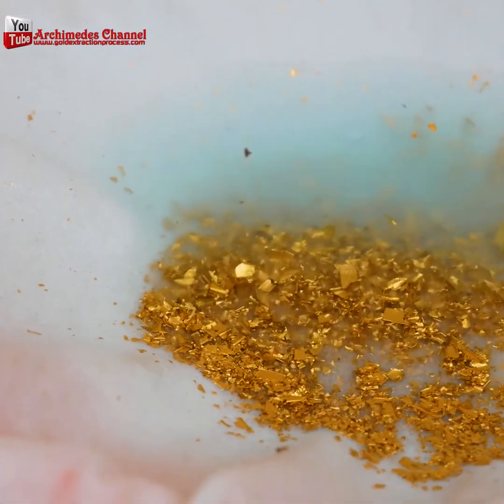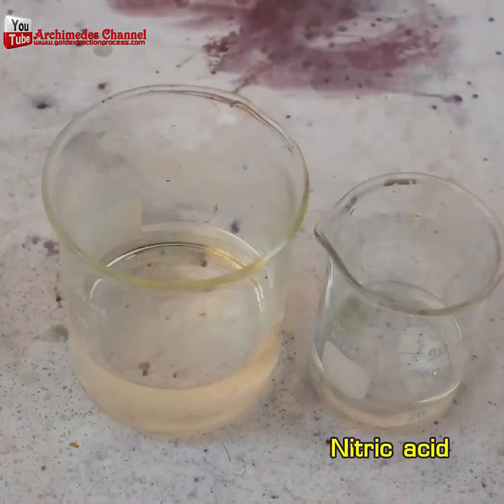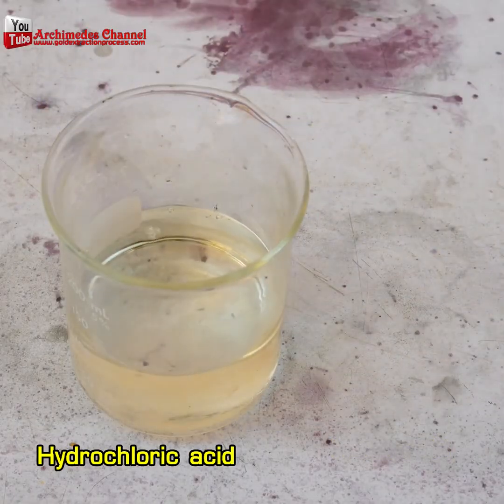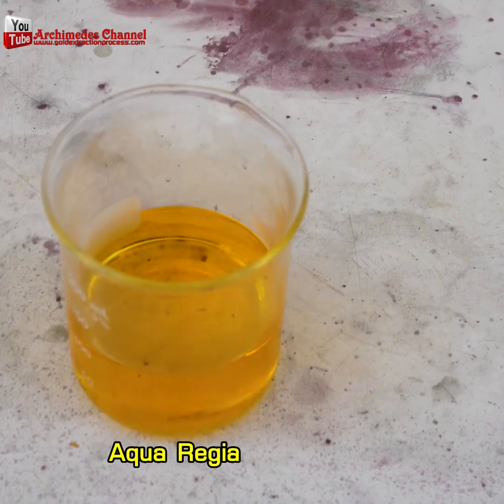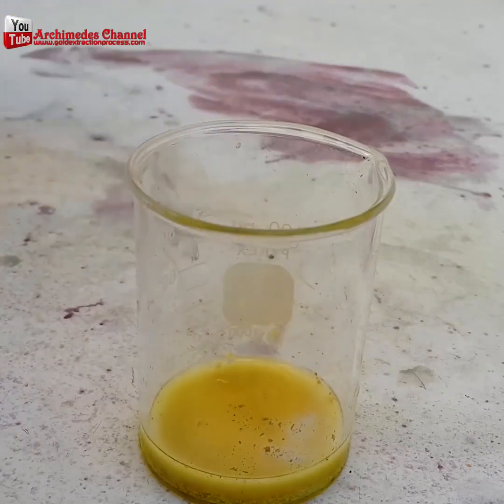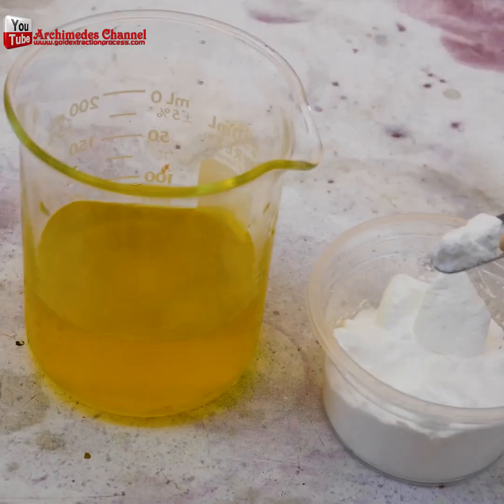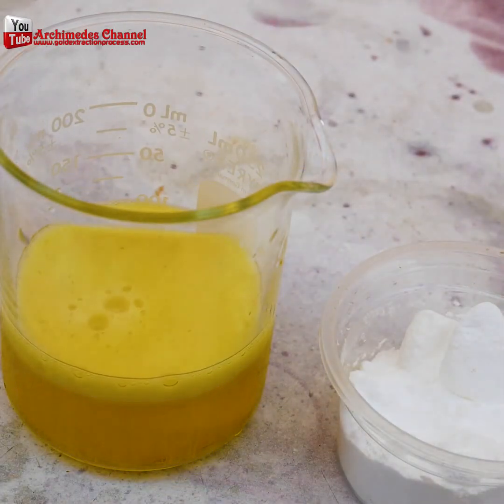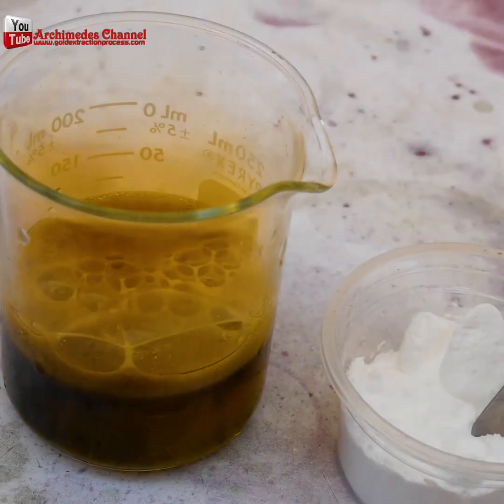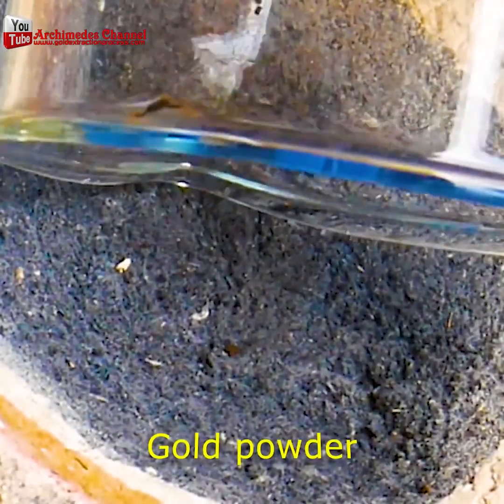Once all the moisture has left and you've collected it all, it's time to put together an aqua regia solution — hydrochloric acid and nitric acid. Pour that over your gold flake; you don't need too much. Then add some sodium metabisulfite and it'll start a reaction that turns the gold powder into a black sludge that rises to the top. Again, you can see fumes coming off — work in a well ventilated area and wear a mask.